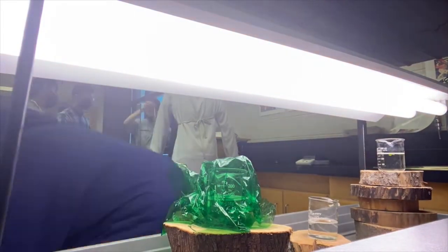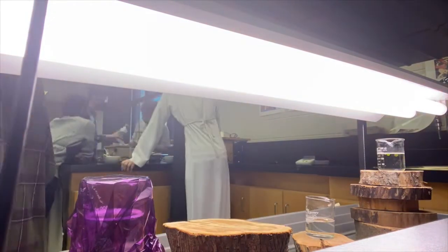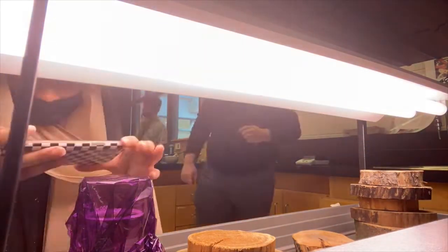Set up the light fixture so that it's 12 inches above the table. Test one wavelength filter and record the number of leaves that rise within 10 minutes. Repeat for each filter with a new paired beaker.